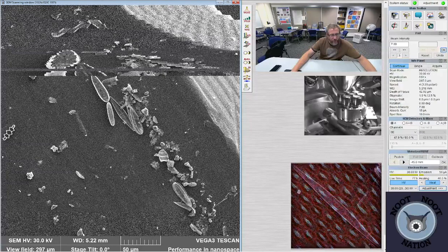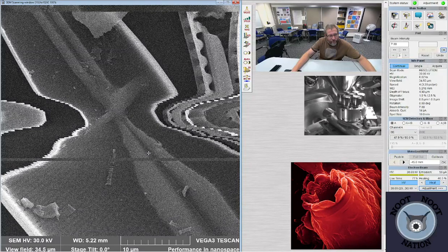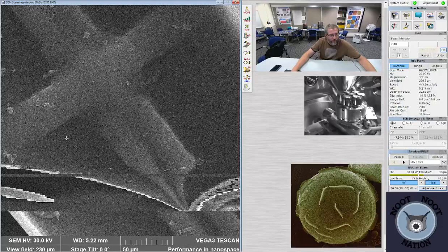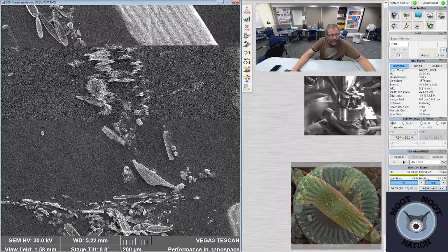This is Stauroneis right here. Again, it has a raphe that runs down the middle, an axial raphe. And this structure right here is the stauros. It's like a big thickened piece of silica that runs across the valve. For this genus, that's characteristic. There are some other diatoms that have something similar called a fascia. And there are some pseudo-Stauroneis-like things that were split off pretty recently, or maybe re-erected recently. Closely related, but imperfectly.